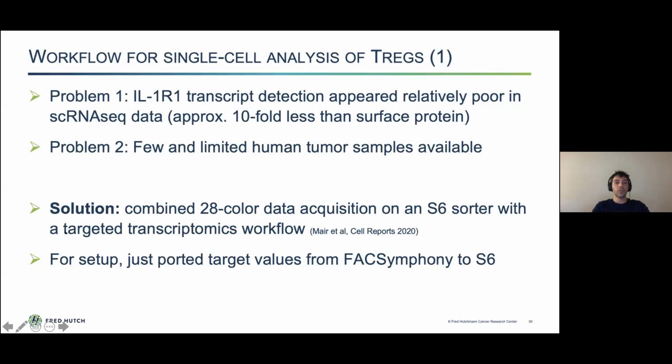And we actually chose here, for two reasons, to use the targeted transcriptomics workflow, which we made a description of earlier this year, which would not only save us some sequencing costs, but also hopefully deliver a better resolution for some of the targets that we were looking at.